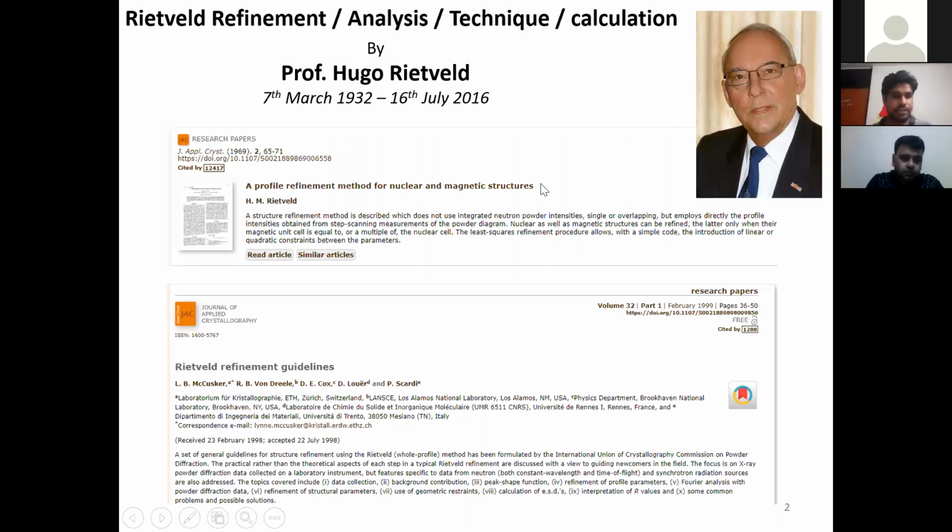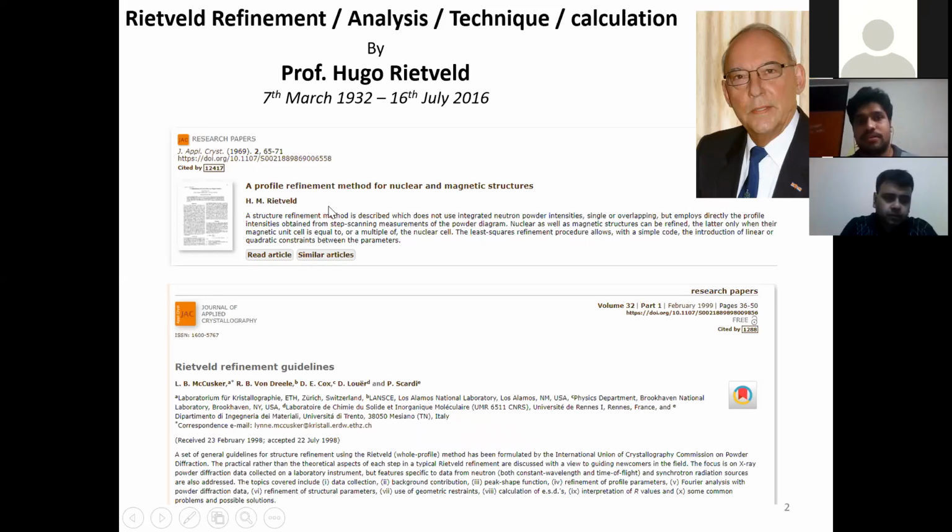Okay, so it was initially introduced by Professor Hugo Rietveld in 1969, and this paper, which I am giving here, is from the Journal of Applied Crystallography. So please go to this paper and read it to get the mathematical formulations, and it is a very nice paper.